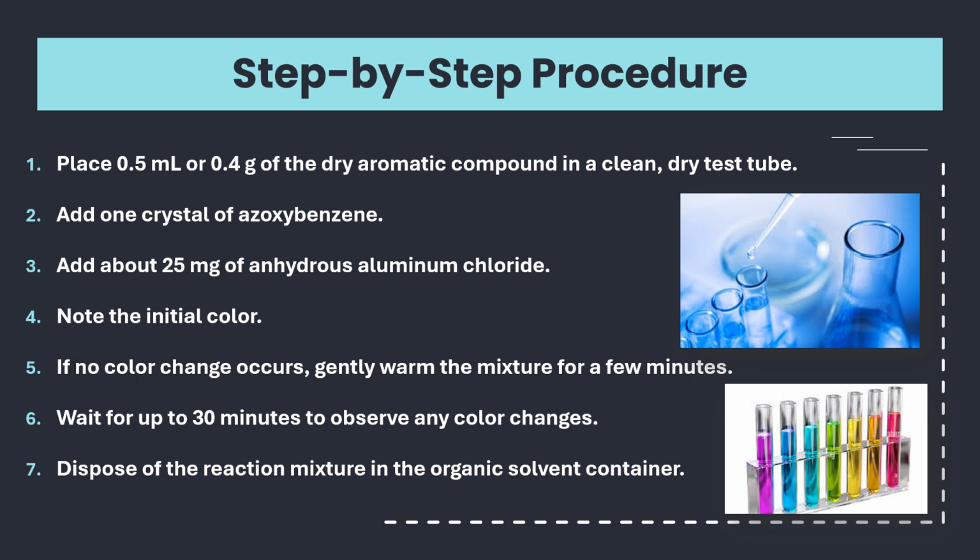If no immediate reaction occurs, we will warm the mixture to encourage the reaction to proceed by increasing molecular movement and reaction kinetics. After that, we will wait up to 30 minutes to allow for the full development of color, and this development of color will serve as a visual indicator for the success of the reaction. And finally, when we complete the experiment, we must dispose of the reaction mixture properly in the organic solvent container to ensure safe handling of potentially hazardous material.